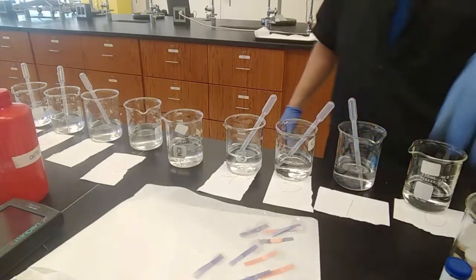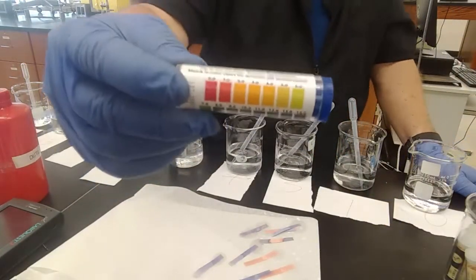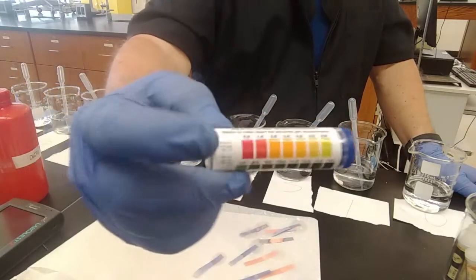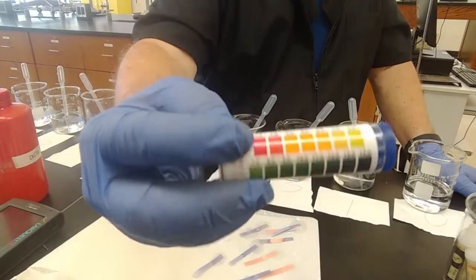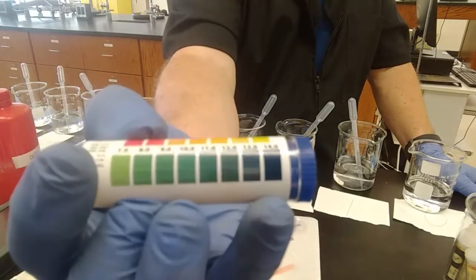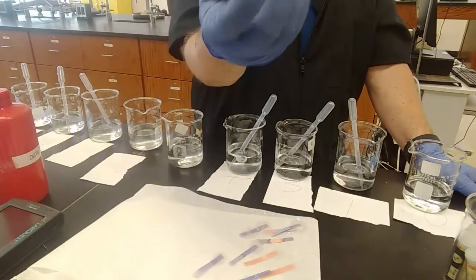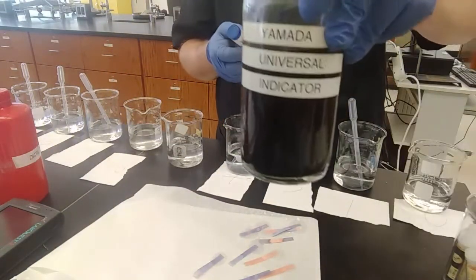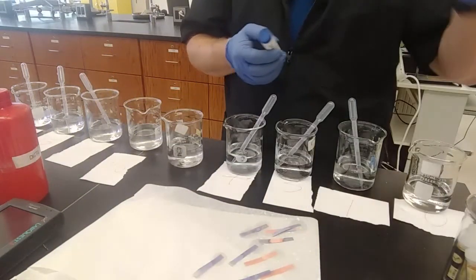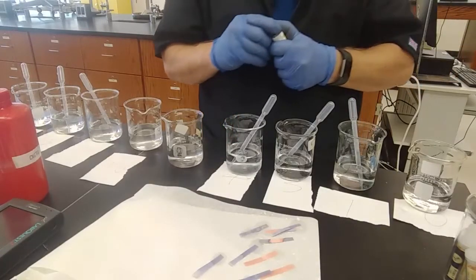What can be more useful is a paper that is universal. You can measure pH 0, should be red on this paper, all the way down to really, really dark blue at pH 14 with this paper. So this is a universal indicator like the Yamada indicator, but dried onto a piece of paper. So this is going to be our pH strip.